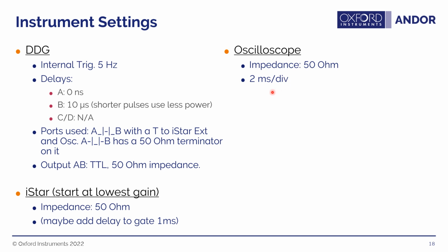So I will show this type of slide before each one of our demonstrations, so you may want to pause on this slide and configure your setup to look approximately like this. And then you can follow along and make adjustments to settings as I indicate them in future slides. And so in the future slides, most of the setups will be quite similar to what I've shown here, but I will indicate in bold red the various settings that are changed from one experiment to another.